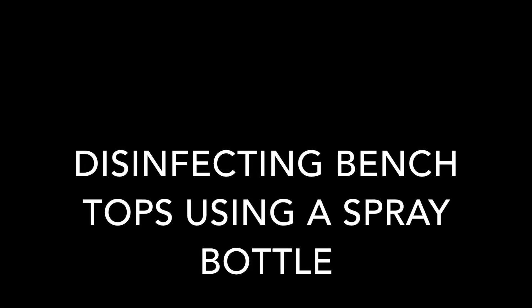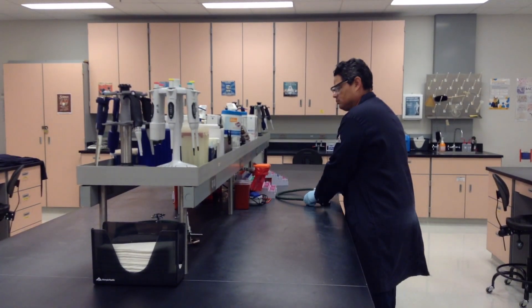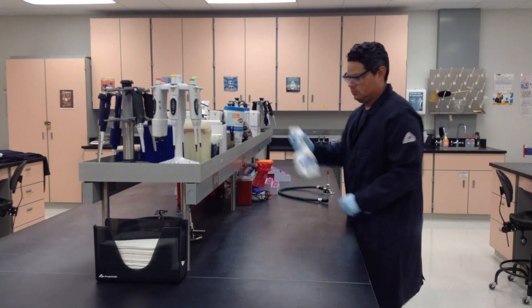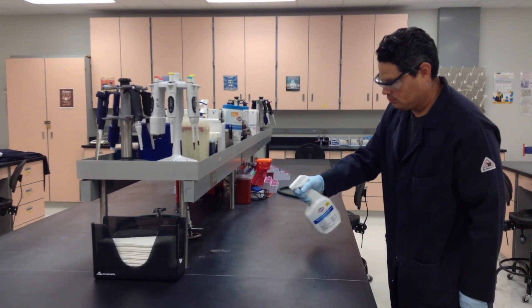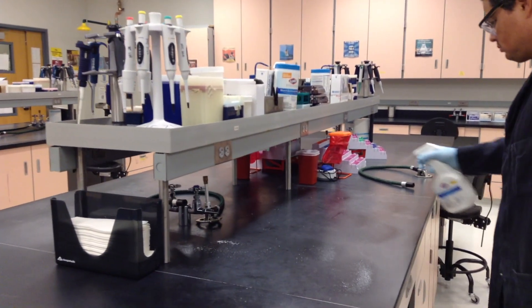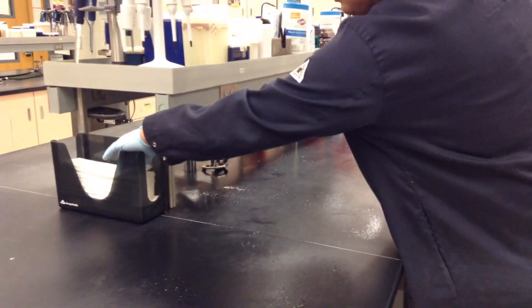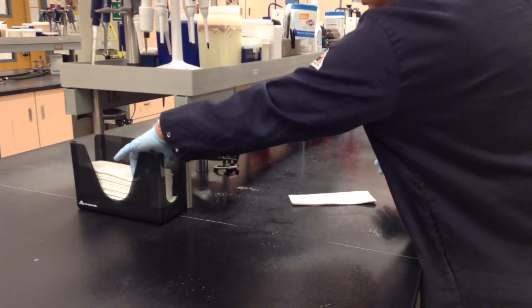Bench tops may also be disinfected using a spray bottle containing 10% bleach or 70% ethanol. Move any equipment that may be in your way and spray the area with the disinfectant. Grab a few paper towels, which are located at either ends of the bench tops, and wipe down the bench top.